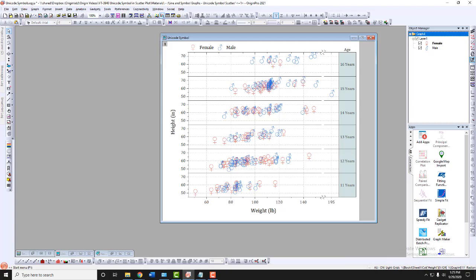In Origin 2021, users can now use Unicode symbols in scatter plots.